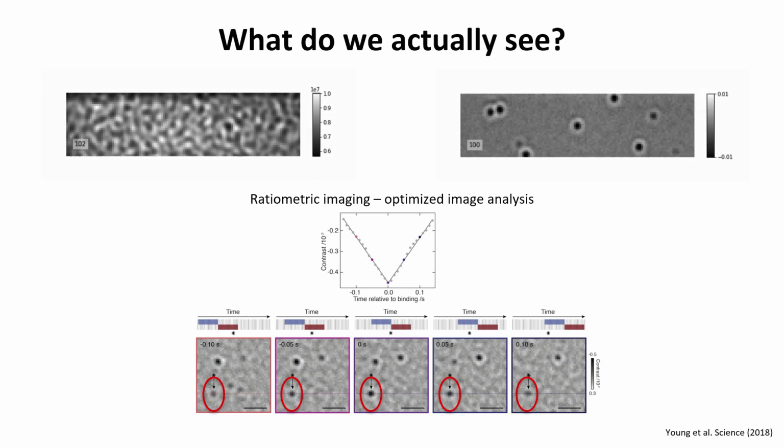So what we do is ratiometric imaging, where we average both frames before and after a certain frame, and then we divide between the two. The before is considered the background, the after is considered the frame, and the particle signal increases and then decreases as we slide this averaging window throughout the whole movie.